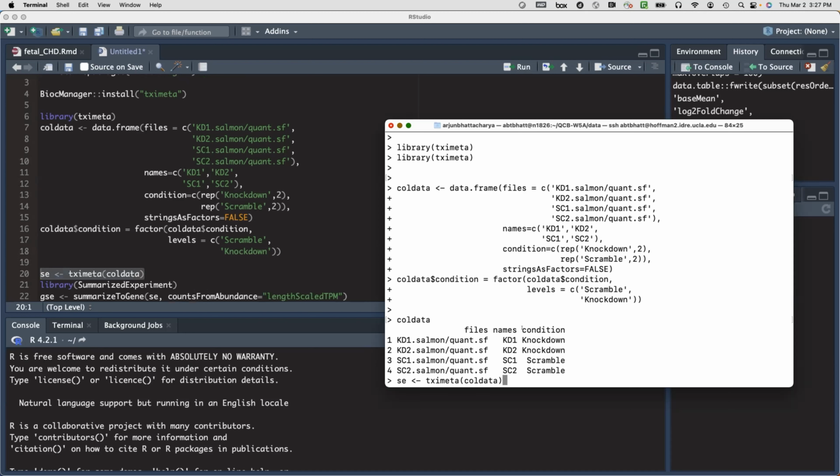So say you have a population setting here, and you have a condition for disease status, but then you have other variables you want to control for in your experiment, like age and sex and hospital visit and things like that. You can tack that onto this coldata, and it's going to integrate it seamlessly in this one line of code.